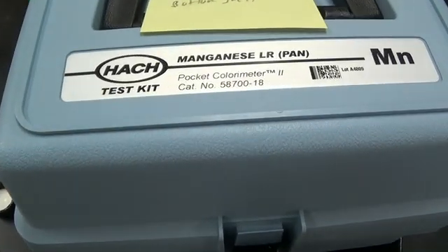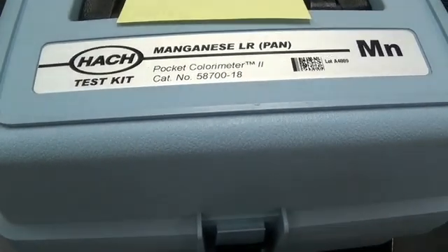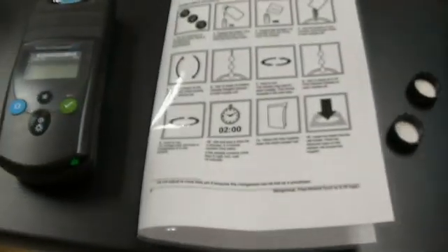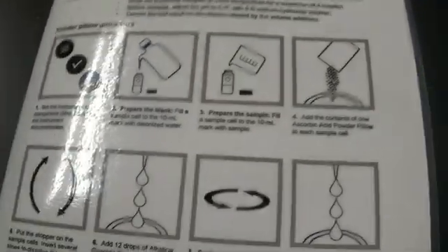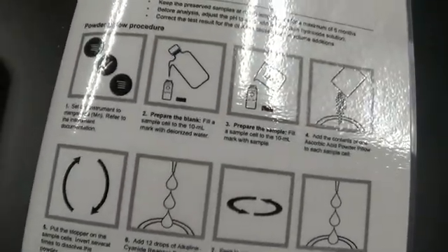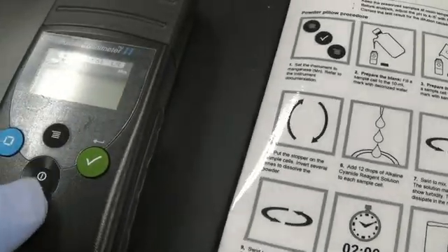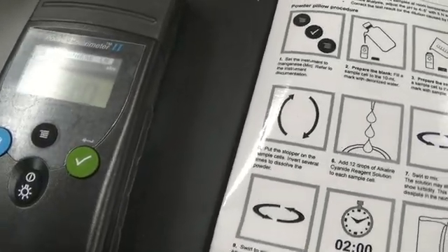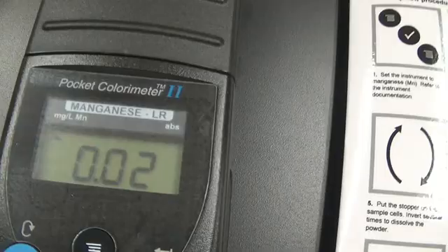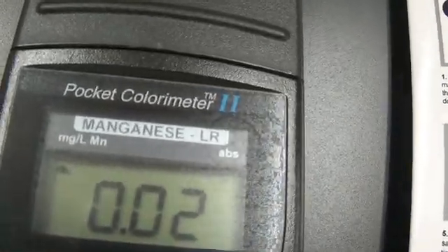I'm going to test my water using this Manganese Low Range Kit. First, I set the instrument to manganese and turn it on. It's set to milligrams per liter.